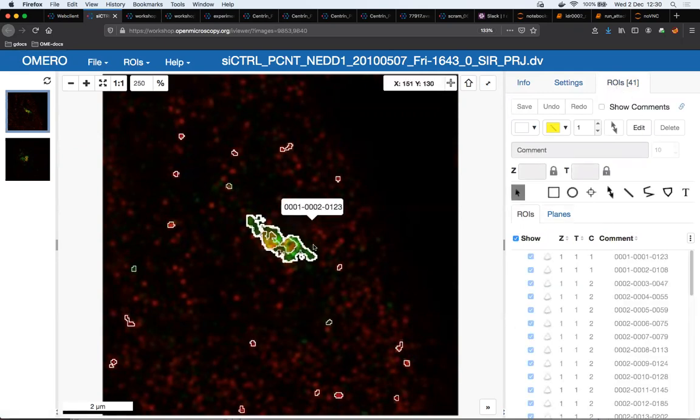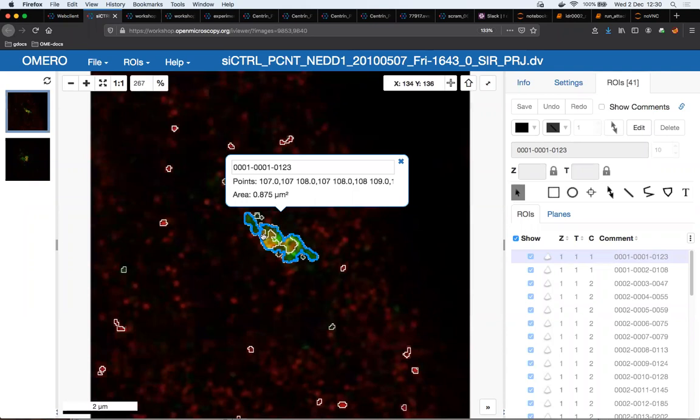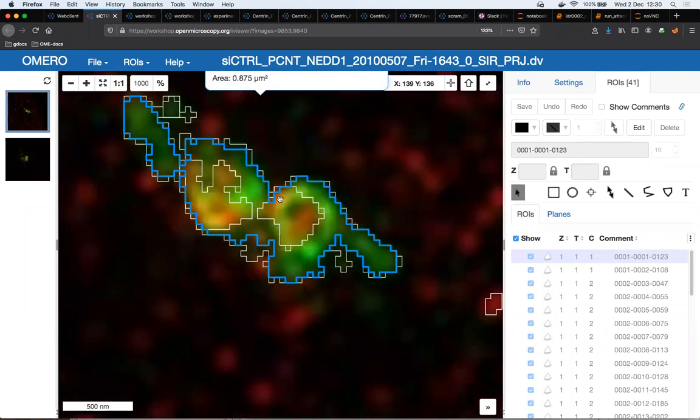And because I was telling you that in those values, it's always the biggest region of interest on the image which is going to contribute to the statistics and evaluation, I can see immediately that this biggest region in this image is invalid. It does not encompass the 2 centrioles in the image, like so.